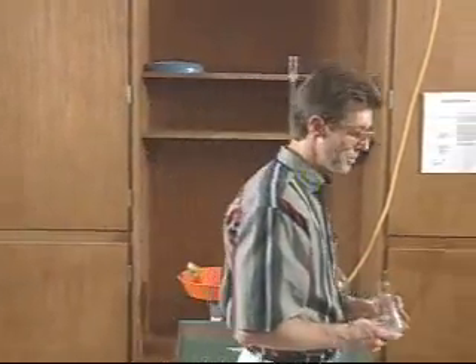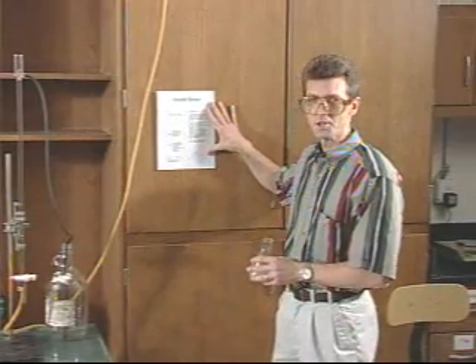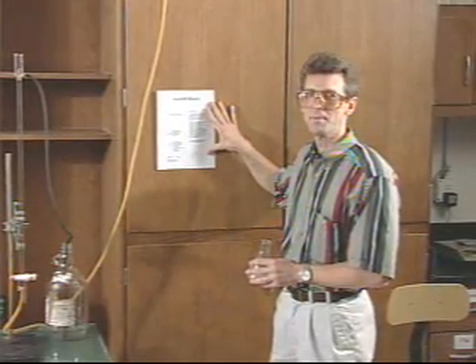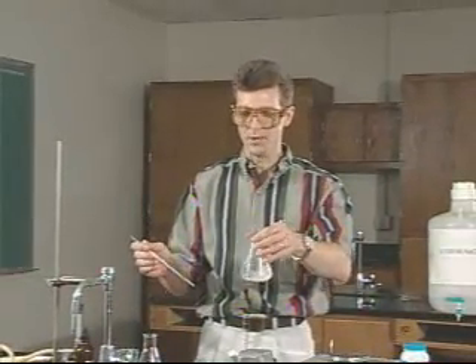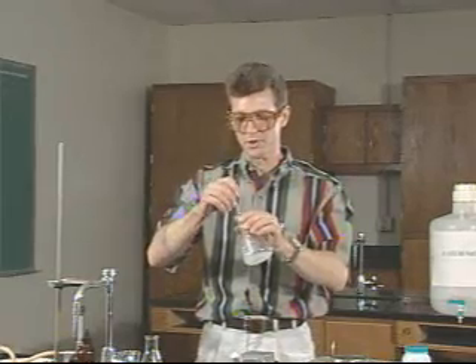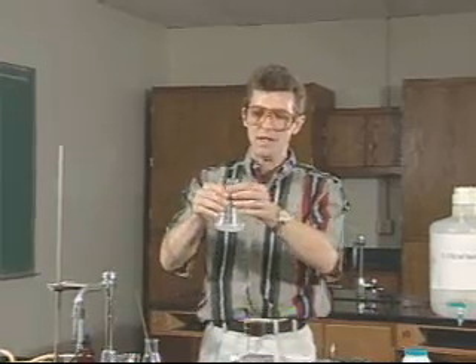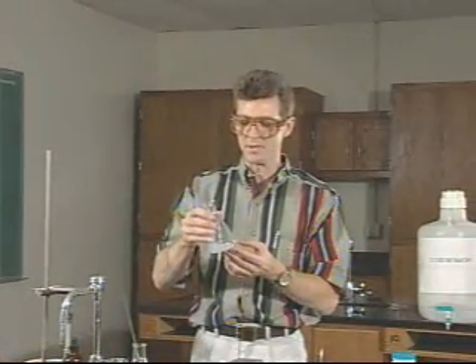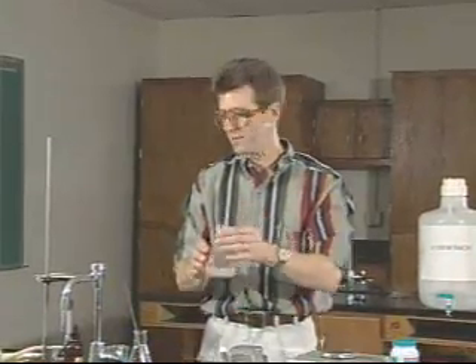If you have any questions or forget any of these instructions, there will be an instruction sheet posted near the autofill burette in the laboratory. Having retrieved our hydrochloric acid solution, we now need to dissolve as much of the tablet as we can. You can swirl it around or use a stirring rod to facilitate things. Not all the material will dissolve because there are some insoluble binders in the tablet that hold it together but don't dissolve. So don't worry too much about the cloudy nature of the solution.